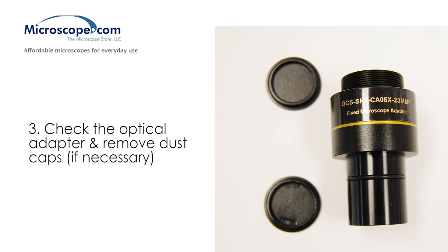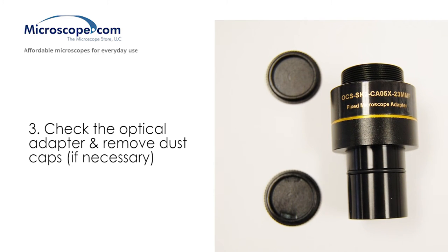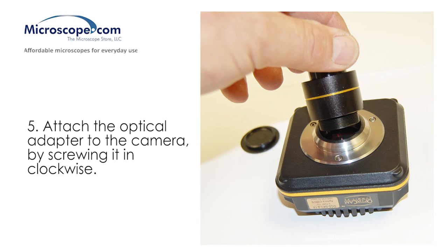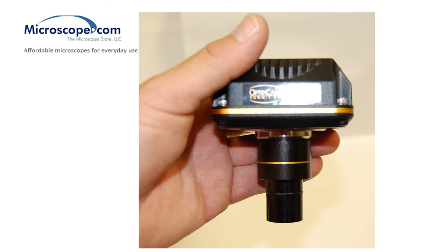Check the optical adapter and remove dust caps from both ends if they are present. Remove the lens cover from the camera. Attach the optical adapter to the camera by screwing it in clockwise. It should screw in until just snug — additional tightness is not necessary.